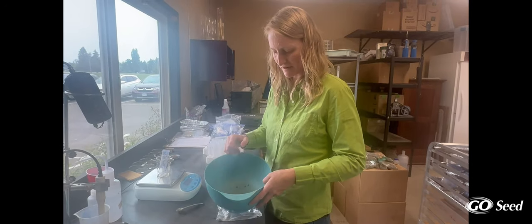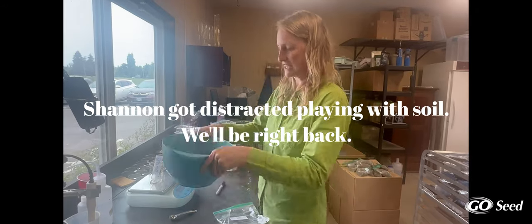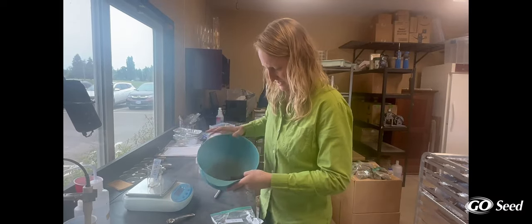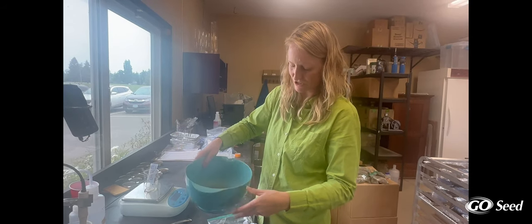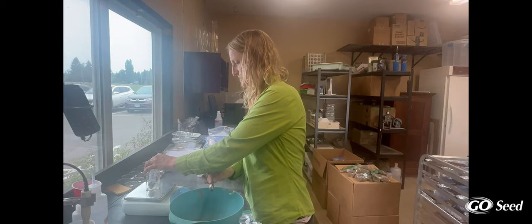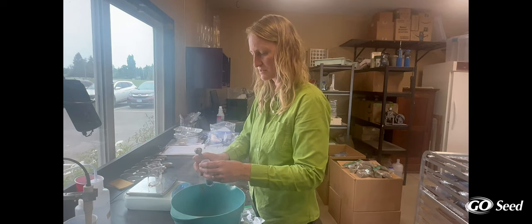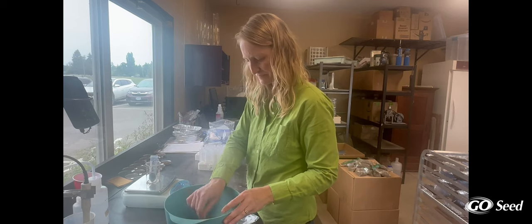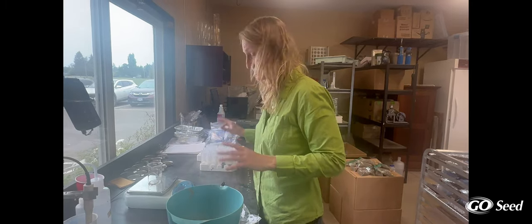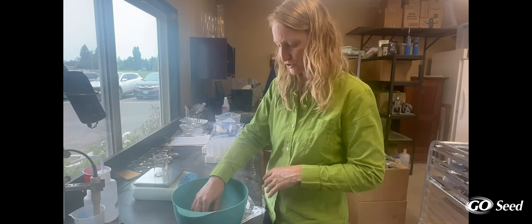I've got soil that is kind of just clumpy right now. I'm going to mix the whole thing up and gently crumble it with my fingers. Now we've got a nice crumbly soil sample, and I can take my scooper and put about 12 grams in there. This has about 20% moisture, so that would be 10 dry grams. Then I will put it in the tray and start the next one. Once the whole tray is full of samples, I will put water in, put it in the shaker, and then do pH and electrical conductivity measurements after that.